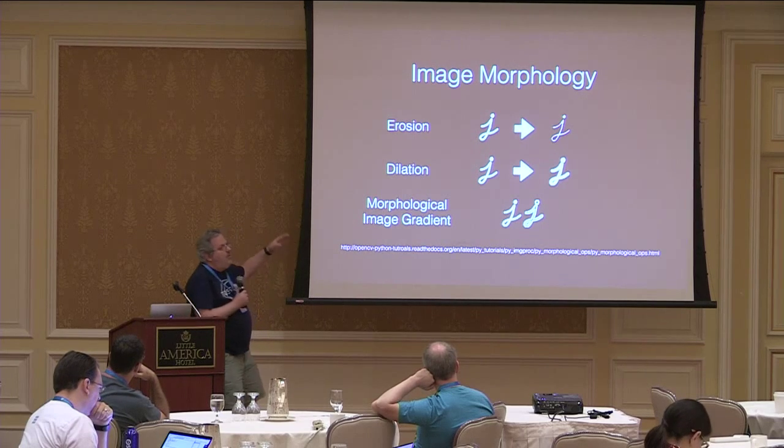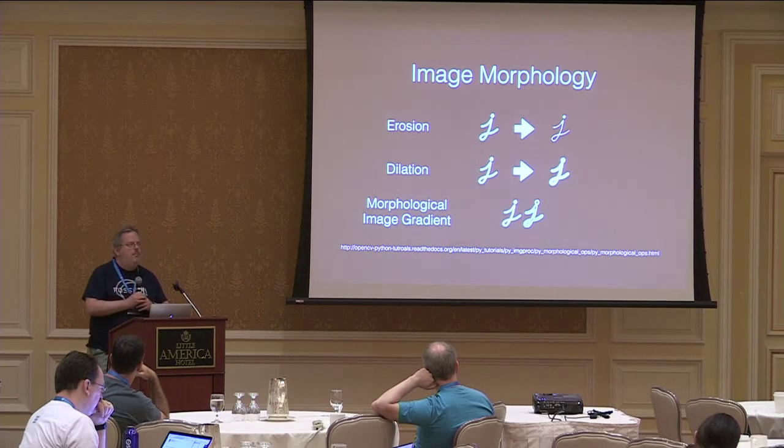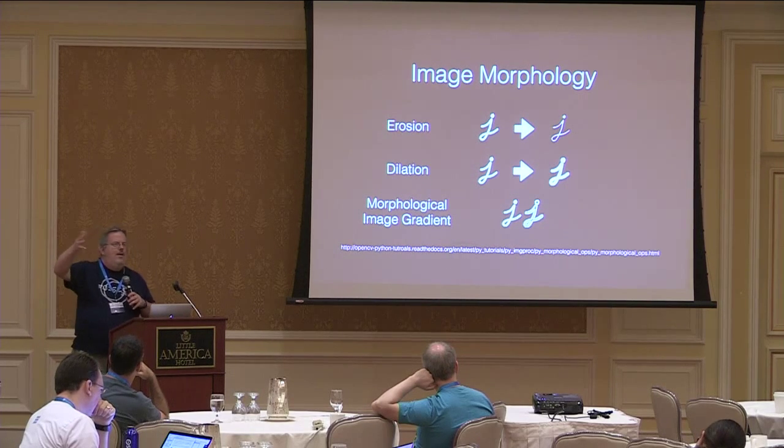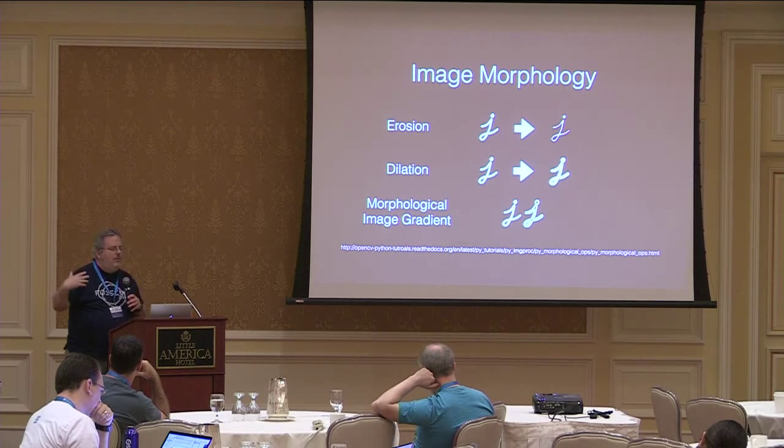So in practice, this doesn't always work for cells, because often they're not evenly lit. They might be brighter on one side than on the other because of how they've been lit up, or just weirdness in how phase contrast works. But it worked okay for this.